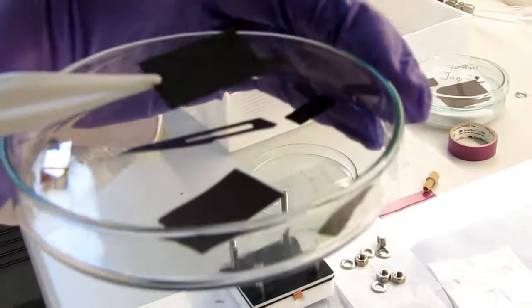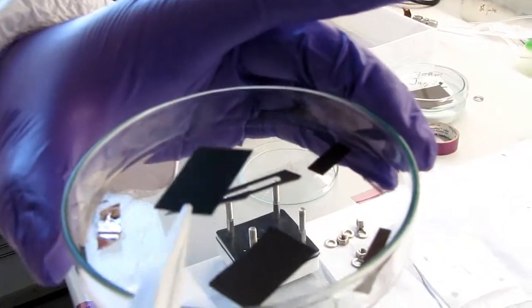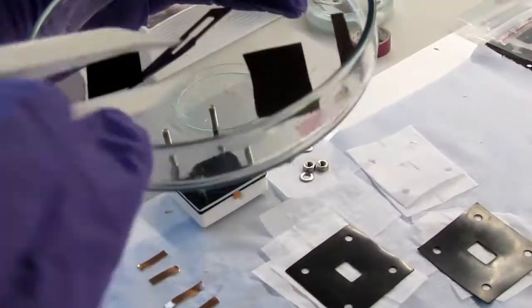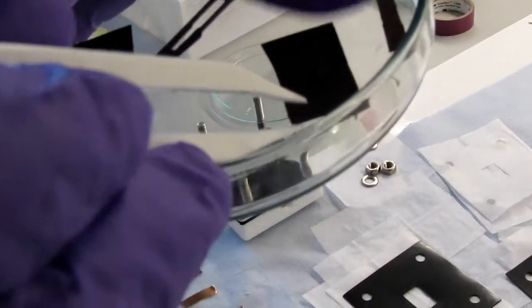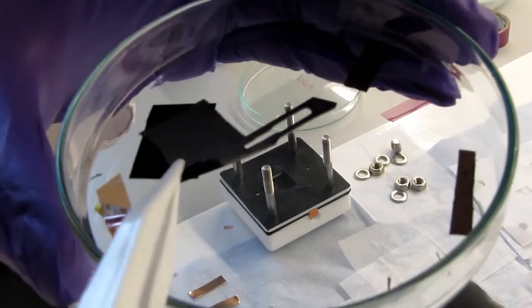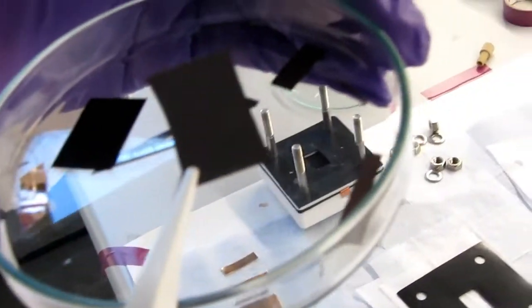So the back side and the front side is a bit different. The back side is just some carbon fibers. We call it toilet paper. So this is the front side. We coated the copper on the top of the microporous side. So it looks like this color after coating copper.